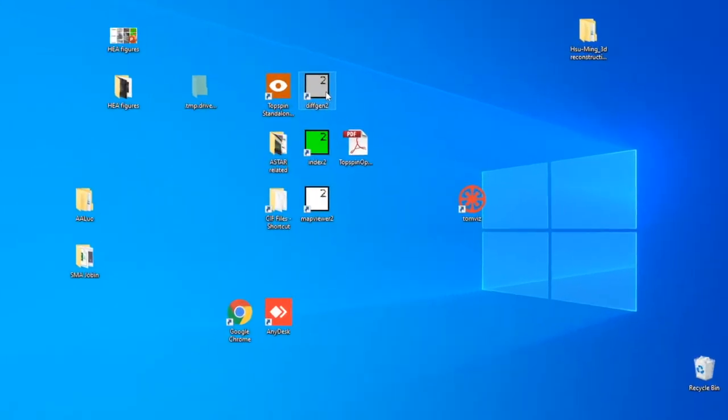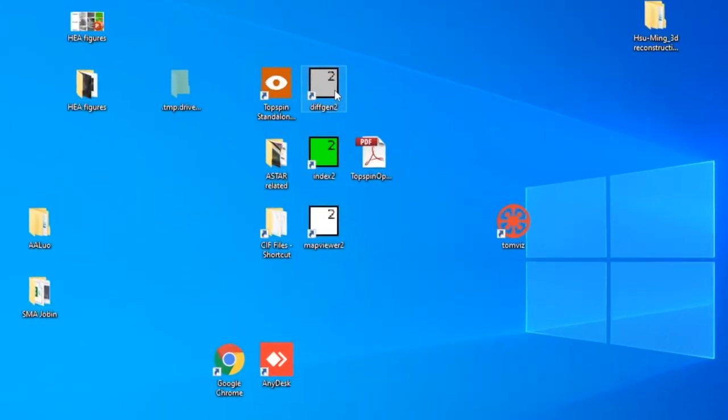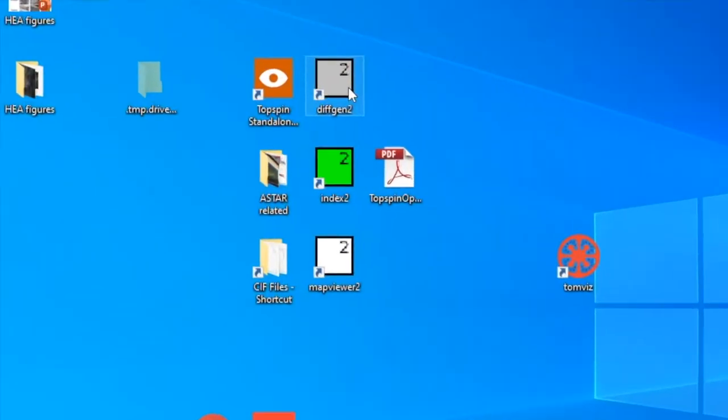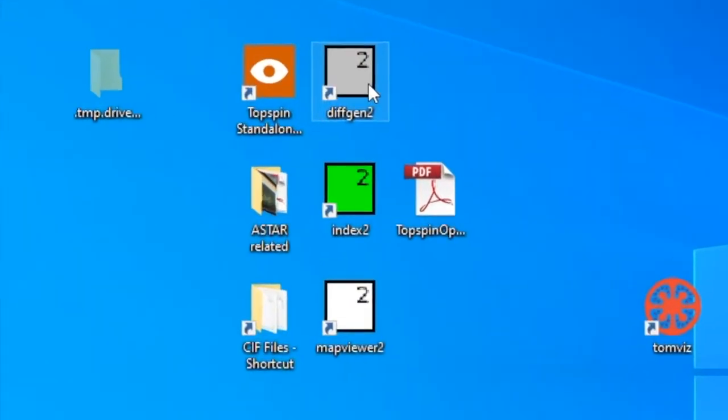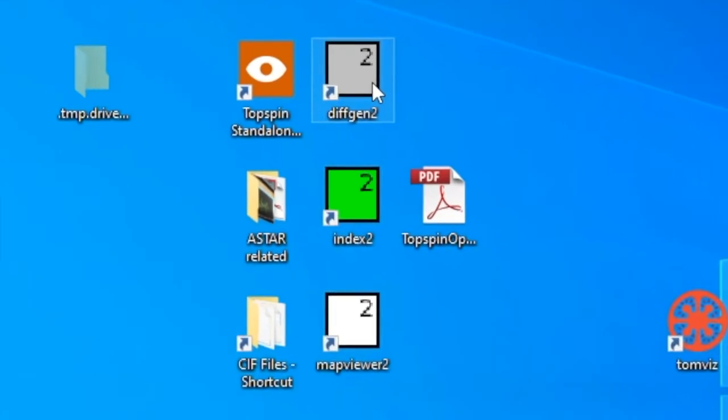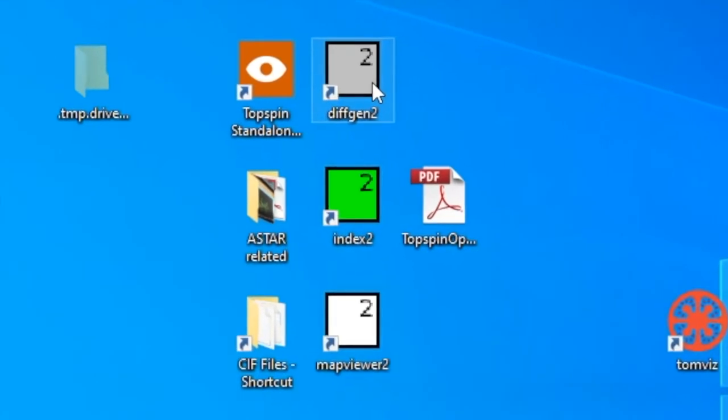There are three softwares you're going to use: DiffGen, Index, and MapViewer. These are the grey, green, and white icons on the screen. Double click on DiffGen first, and a window will open.